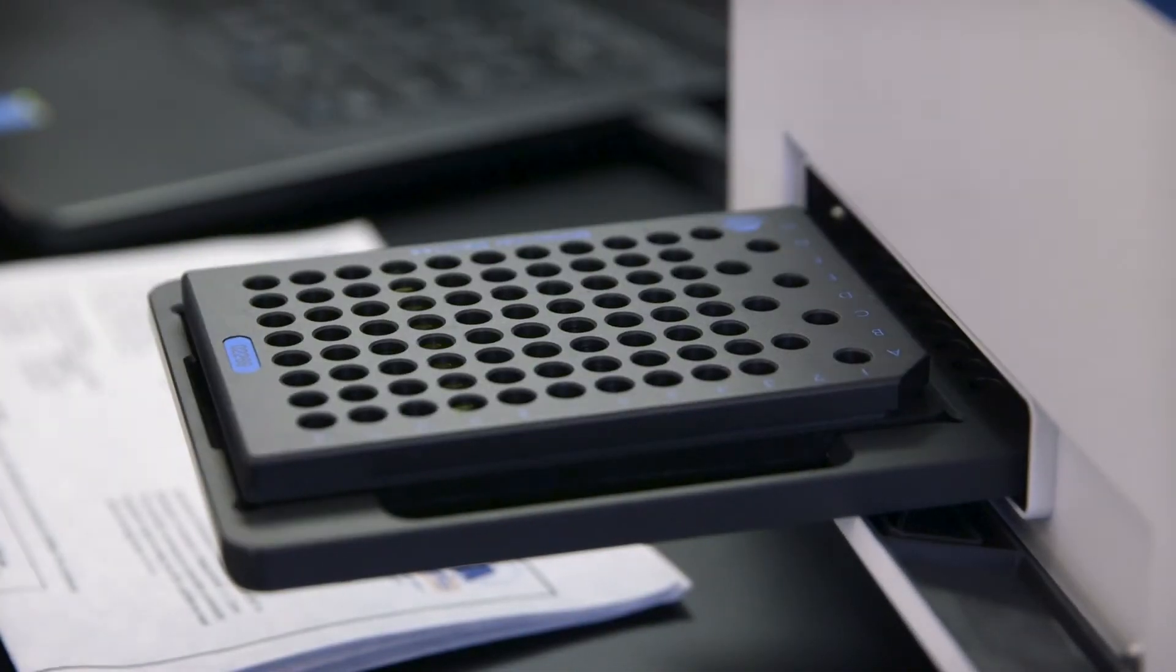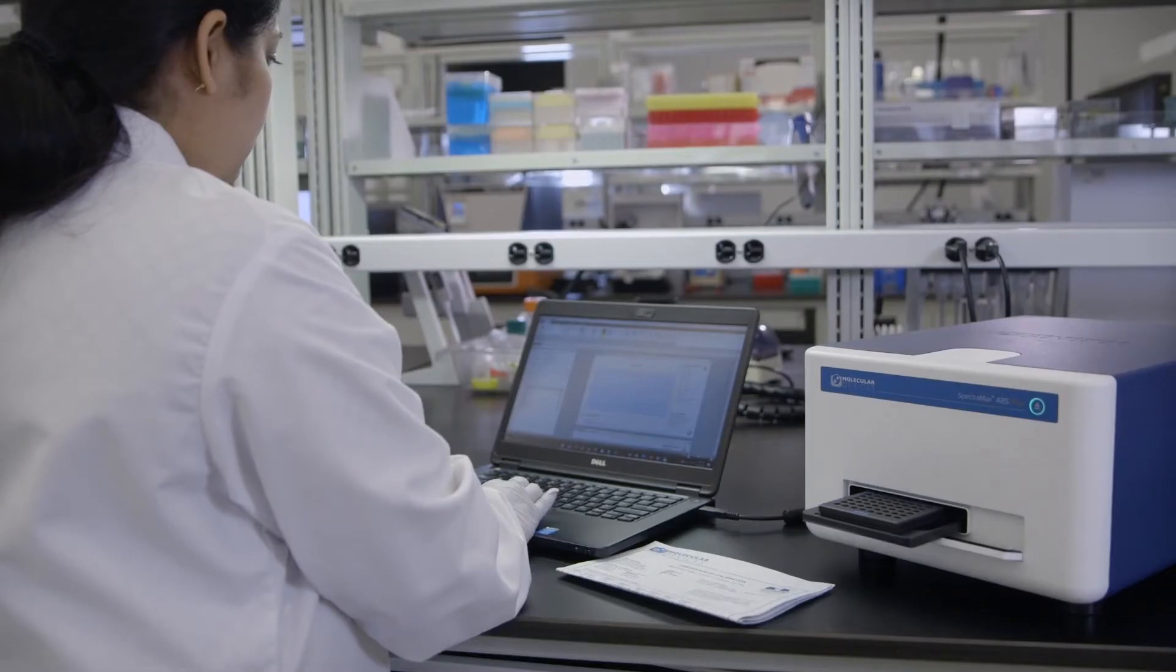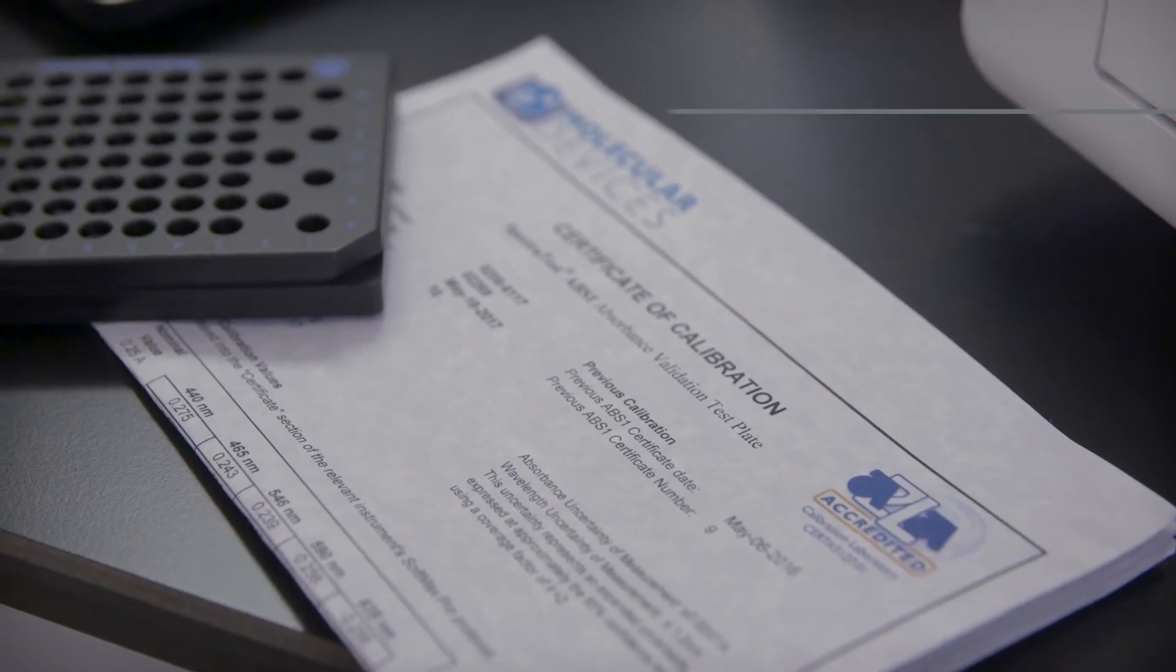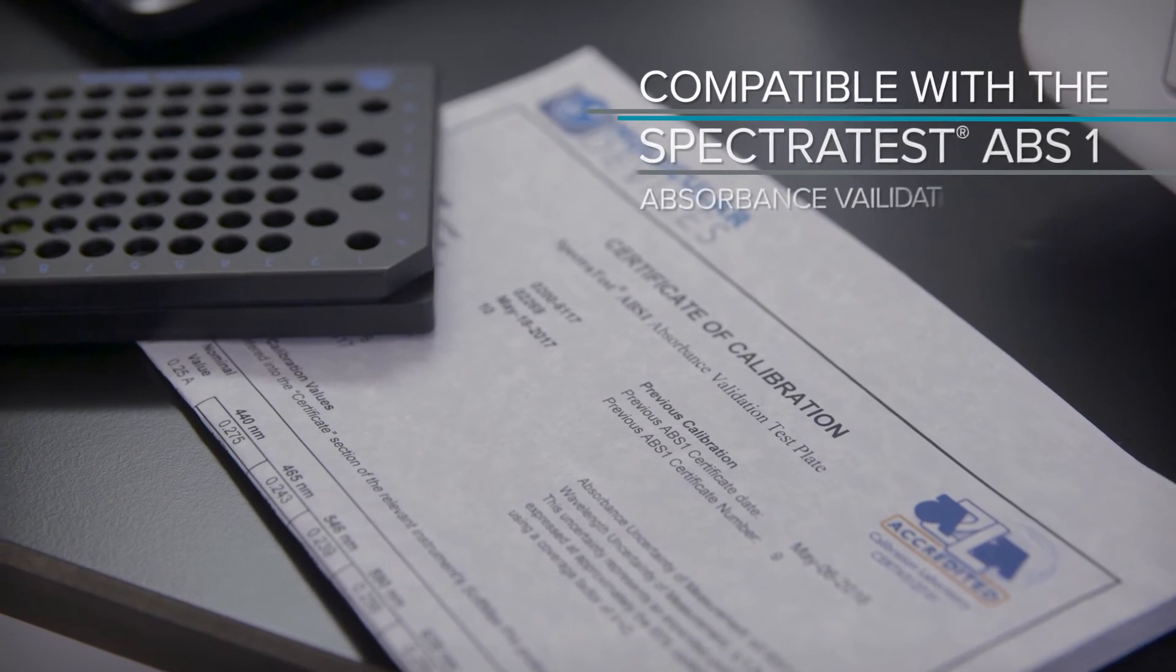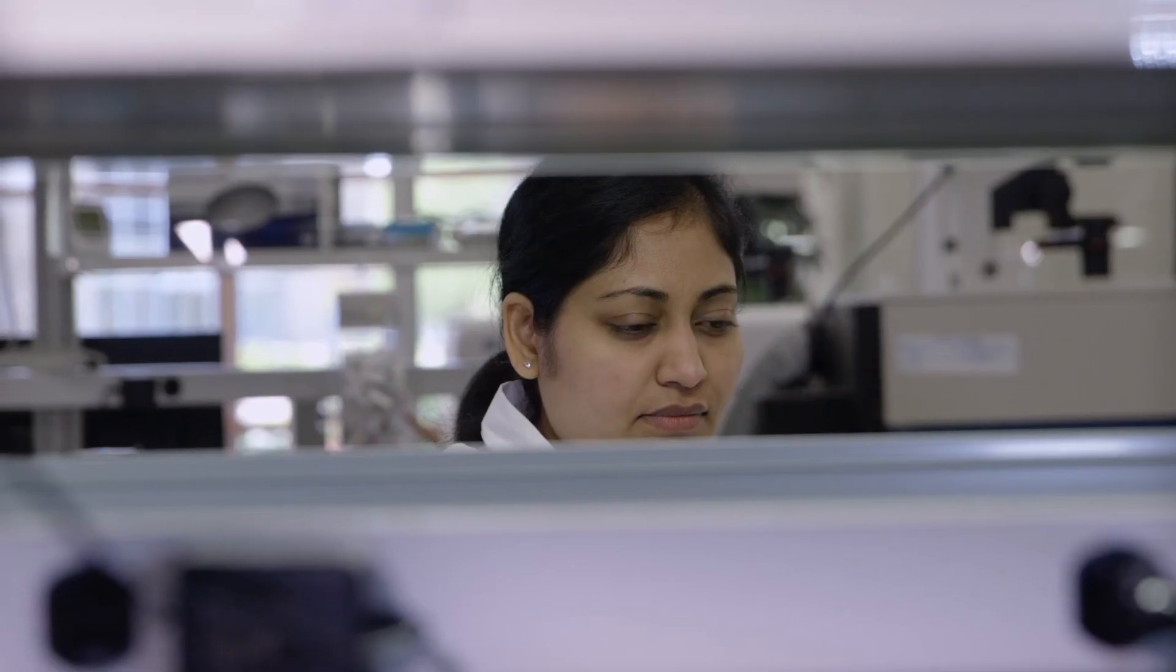Further ensuring reliable performance, the SpectraMax ABS is compatible with the SpectraTest ABS-1 absorbance validation plate. A must-have tool for GLP and GMP laboratories.